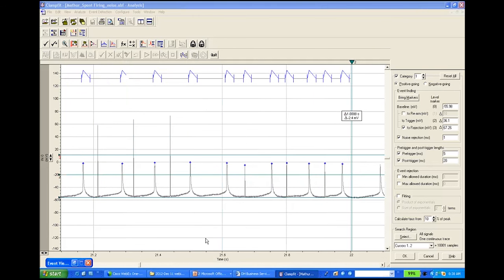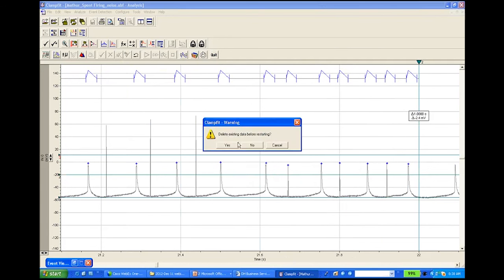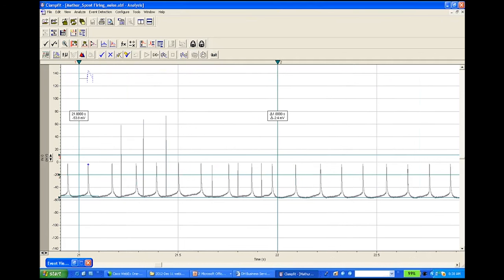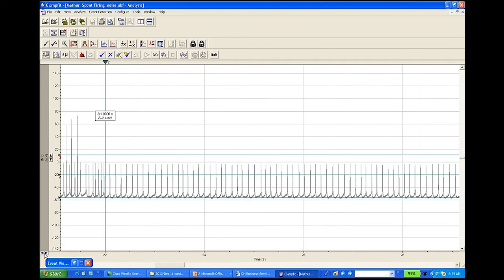So what we can do is set 1 millisecond, hit OK, and then we can redo it. Okay, just want to give you guys a better view. I'm sorry.